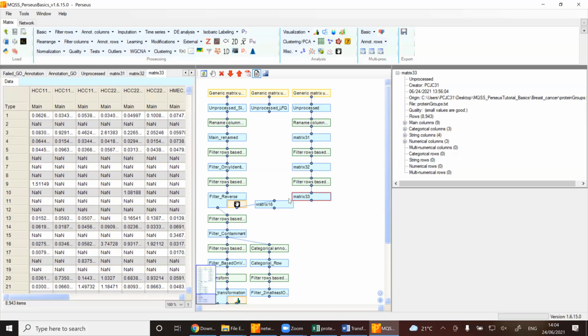But it might be that you have a biological setup where these keratins are actually pretty useful, or you need them for the analysis. So I will do it later, again, filter out all the contaminants, which are usually the keratins, but what you can also do is manually filter. For that you need select rows manually.